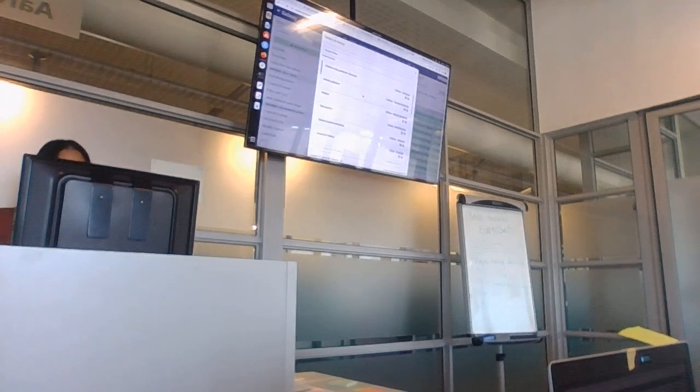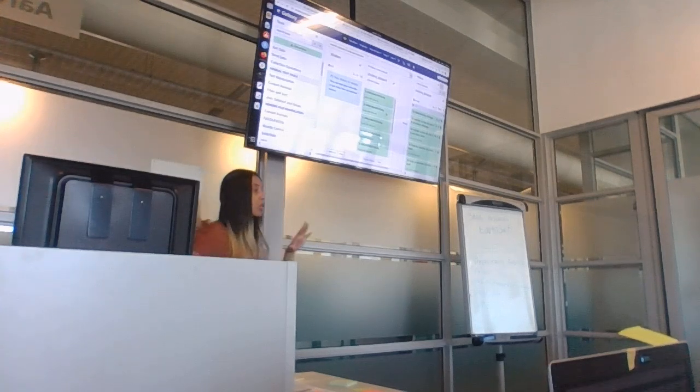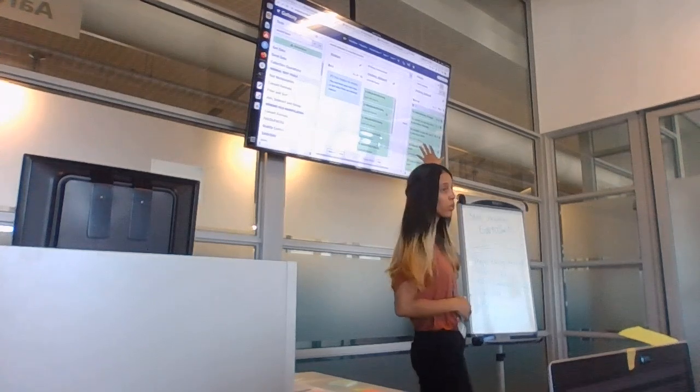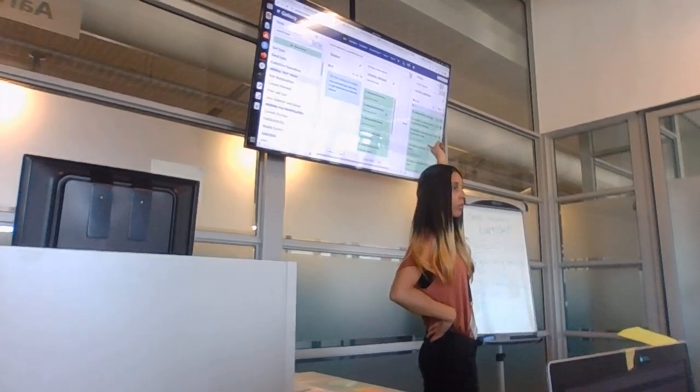Don't look at my history. You won't have the same thing. When you finished your sequencing, you had a whole bunch of files. You had like 8 and 8. Okay, so if you now have your histories in the middle, you will see that you have that file on top that you just uploaded to this cholera dataset history. Yes. Can everybody see that file on top?